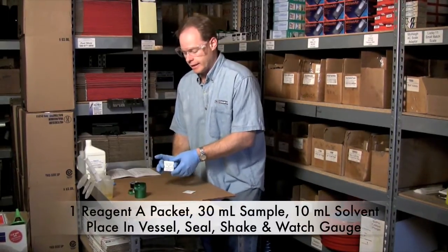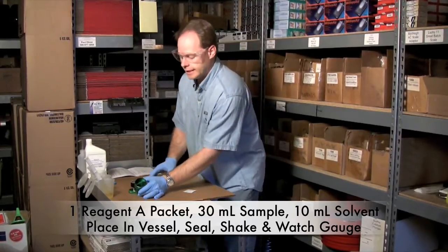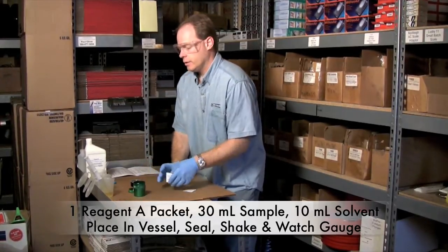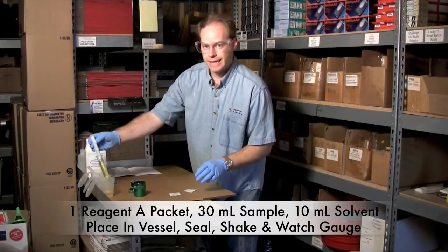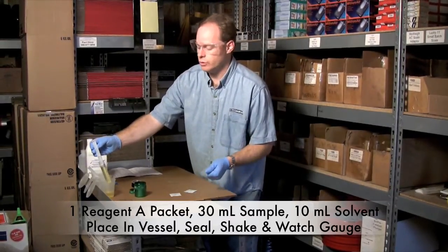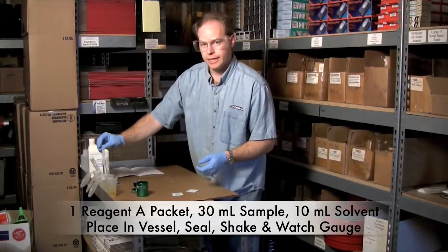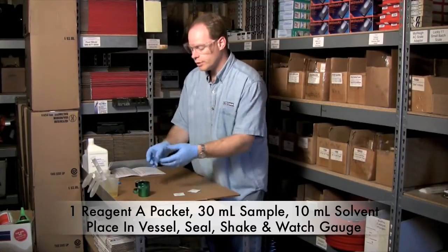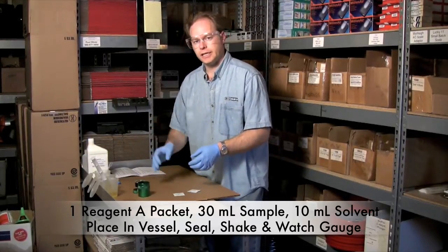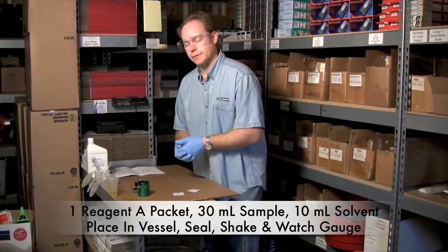To do the test, you're going to take a packet of Reagent A and put it inside this cup in here. We're going to draw 30 milliliters of our sample — I'm sampling some new oil — and 10 milliliters of Reagent B, which is this solvent. Put it in there, screw it on, shake it a little bit, and let the reaction happen for about five minutes, and then we'll see what the gauge says.